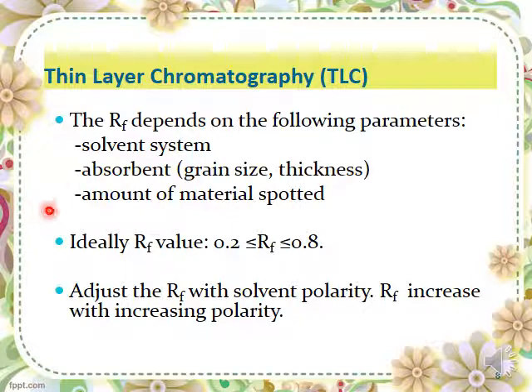Thirdly is the amount of material spotted. Ideally, the retention factor value should be between 0.2 to 0.8. If you don't get a value in this range, it means we have to change any of these three parameters.